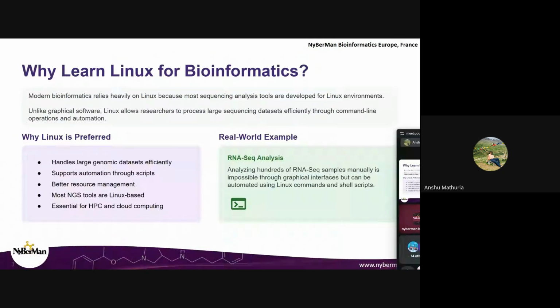So fastqc is generally run in the terminal, and that remains constant for all the analyses that we're going to do. Because the first step that we take is to understand the quality of the data that we have received from our sequencing machine. All these tools, whichever we are going to use, are highly compatible with Linux, and bioinformatics heavily relies on Linux because of these tools. Most of them are made so that they can be used in the Linux environment. That is why we preferably choose Linux whenever we have to do a bioinformatic analysis.